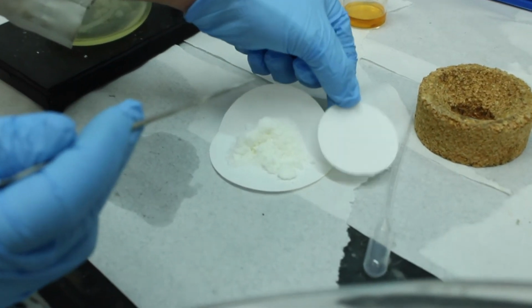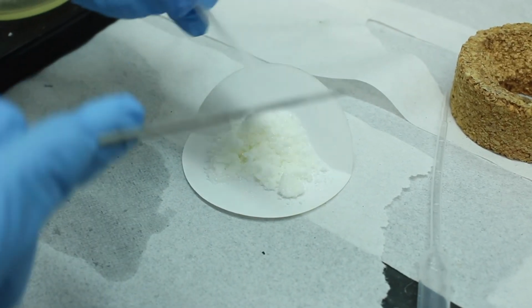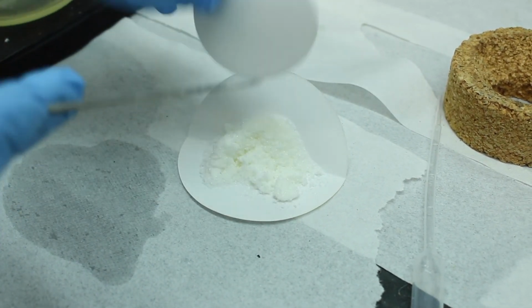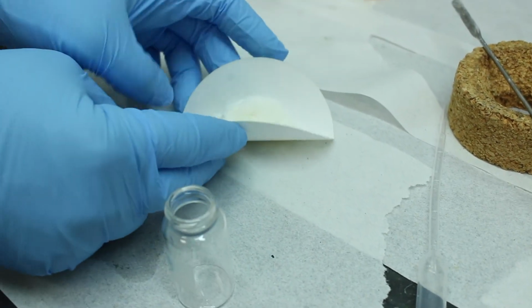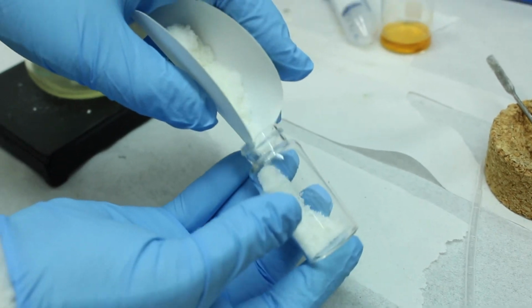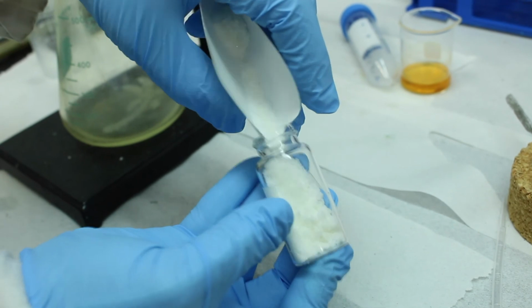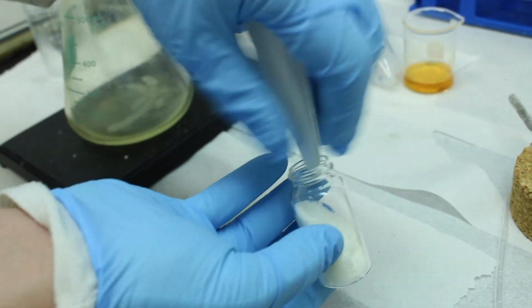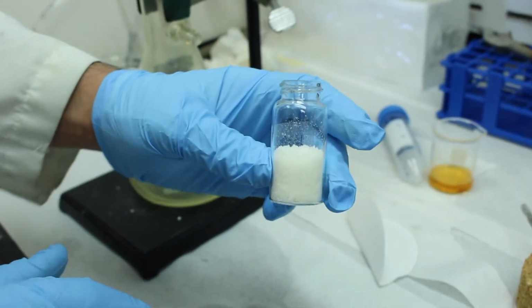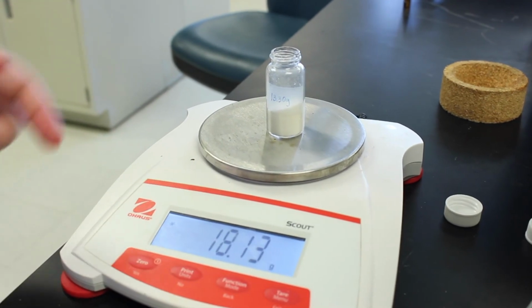Okay, looks good. Here's our filter paper. Try to scrape off anything there. There's not much here though. Okay, there we go. Okay, so we have our solid here.